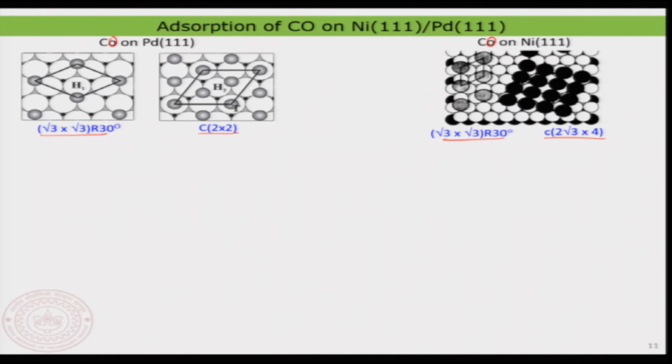So, let us look a little bit back into the energetics that we have talked about. Whenever we talk about the adsorption of a molecule on surface, we know that there are two major energy contributions that come into the picture at lower coverages, that is for sure. You have this particular periodic type of energetic that comes due to the delta E inter, and this is from the molecule surface interaction.